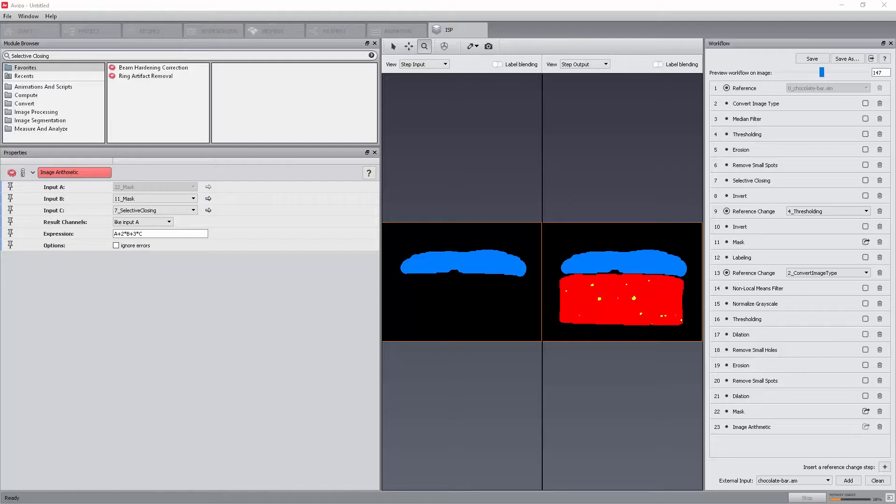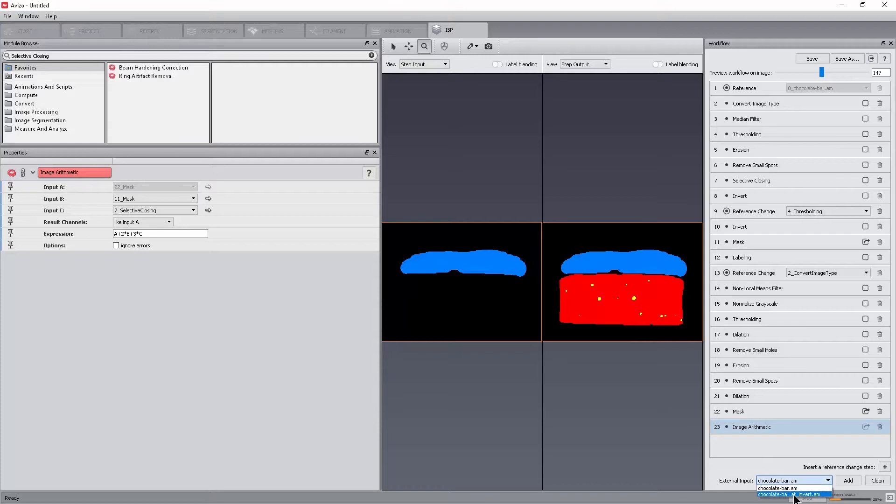As an example, let's use the inverted nougat mask data that we originally loaded. Here is how we would include it as an extra input to the image stack processing. Look in the external input field at the bottom of the workflow panel. The list is populated with external data compatible with the current workflow. Select the external data to add to the workflow.